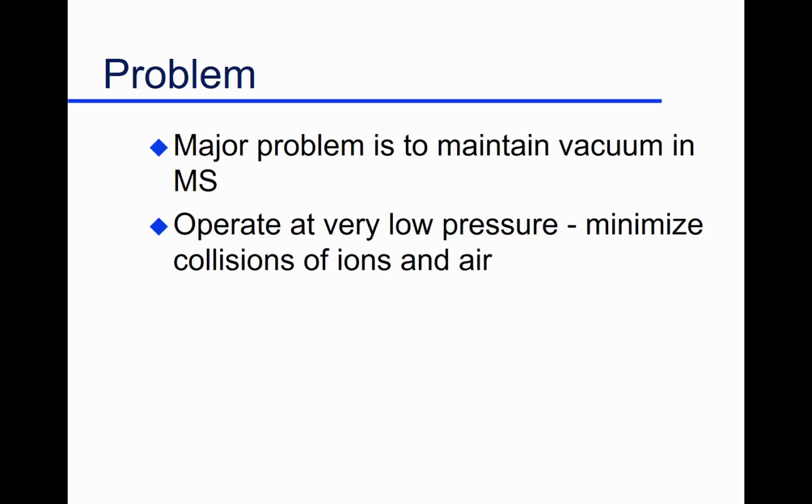So you need a high vacuum. Now, how the heck do you get the system to operate under a vacuum when you're pumping gas chromatography carrier gas into the system? And you might say, well, if you think about it, GC flows, or gas chromatographic flows, may be 2 mL per minute. Okay, you think that's not a lot. The vacuum pump should be able to pump that out, maybe. But if you think about what that 2 mL is, volume, if you put it under 10 to the minus 6th torr, it's one heck of a volume that you have to pump out of there.